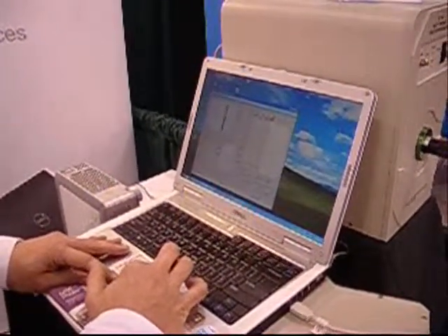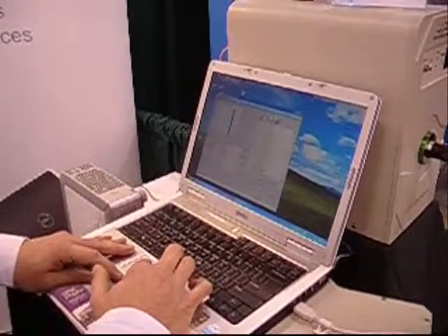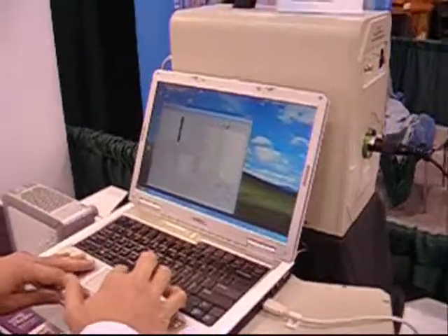The software also is extremely flexible and easy to use. Here you see some of the controls involved.